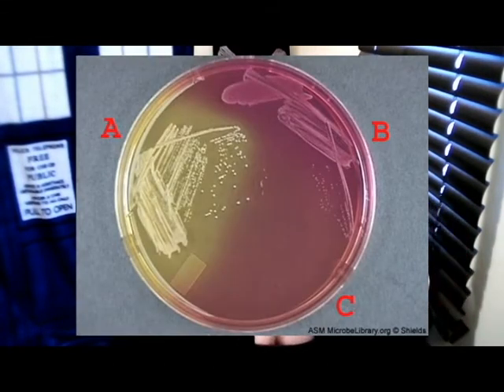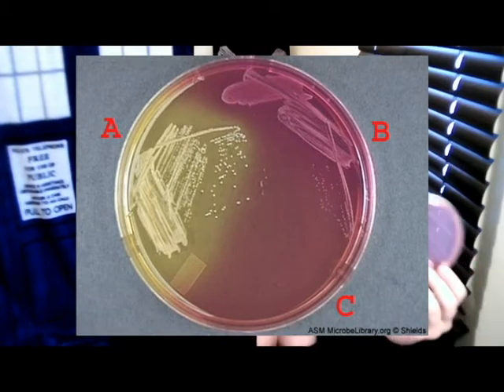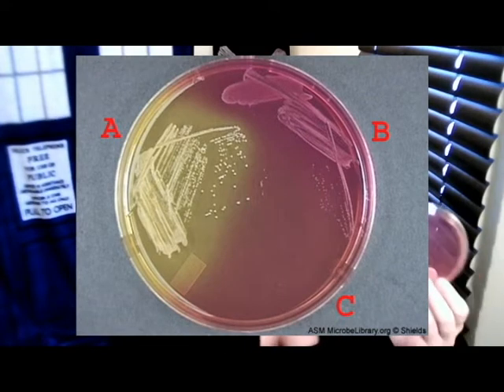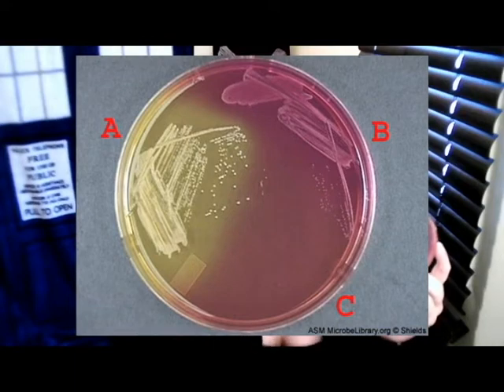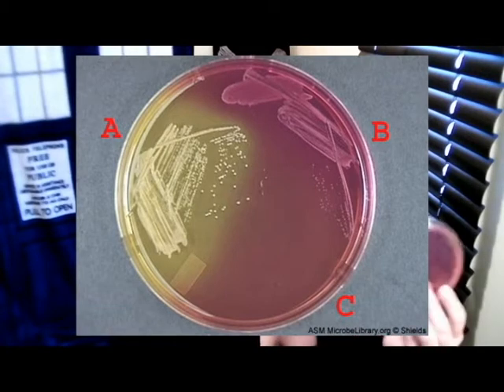The reason it's a differential media is because it can differentiate between bacteria that are able to ferment mannitol, mannitol salt agar, and those who cannot ferment mannitol. So if a bacteria is able to ferment mannitol, this mannitol salt agar will go back to being the color of a soy agar, and if it's not able to ferment, it will remain pink and the colony will grow on it.